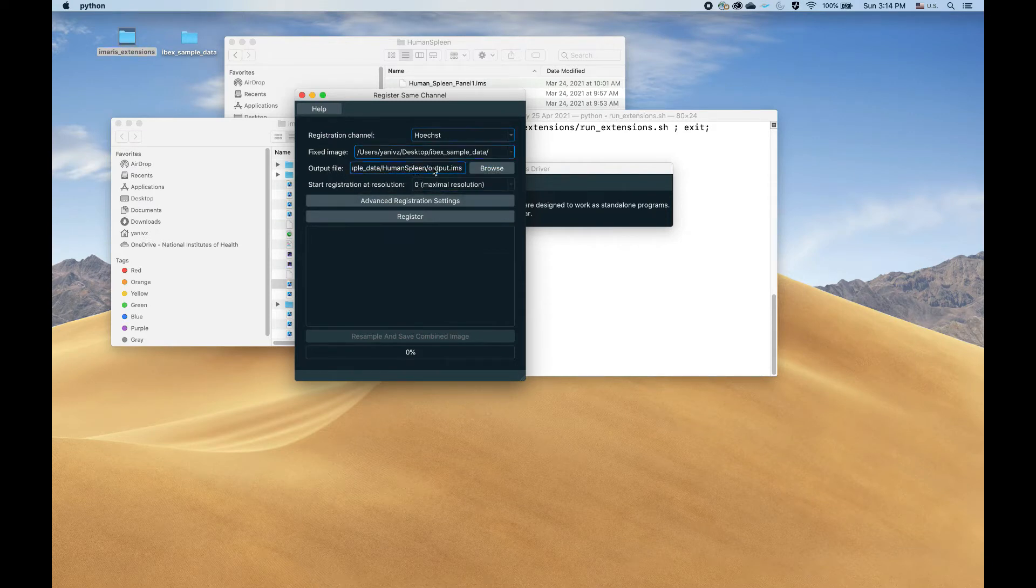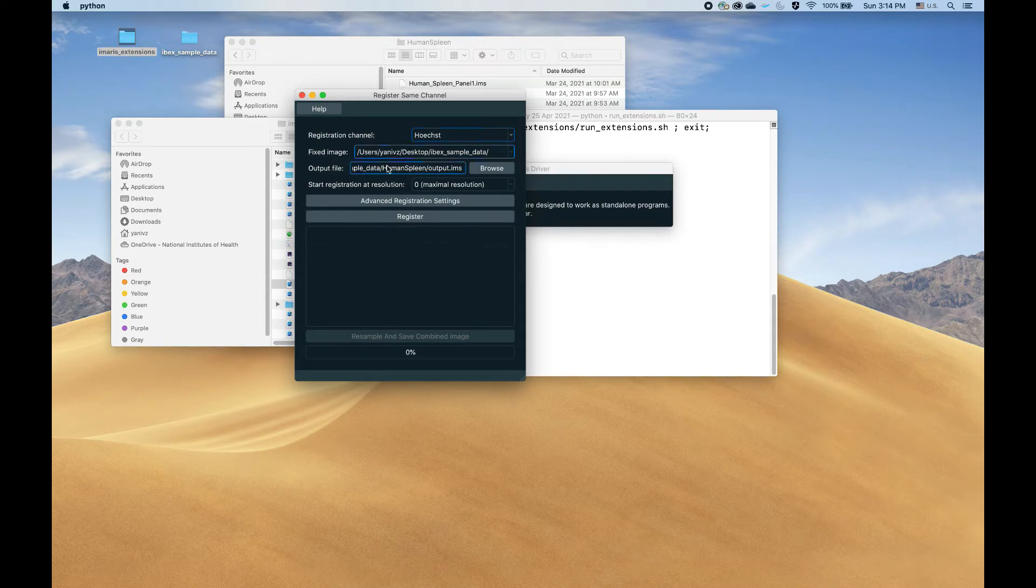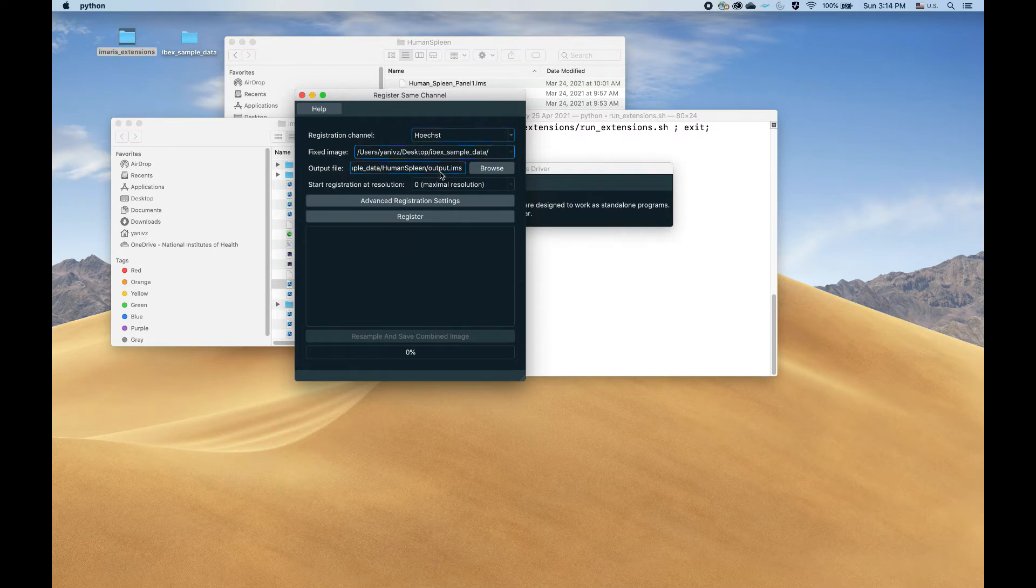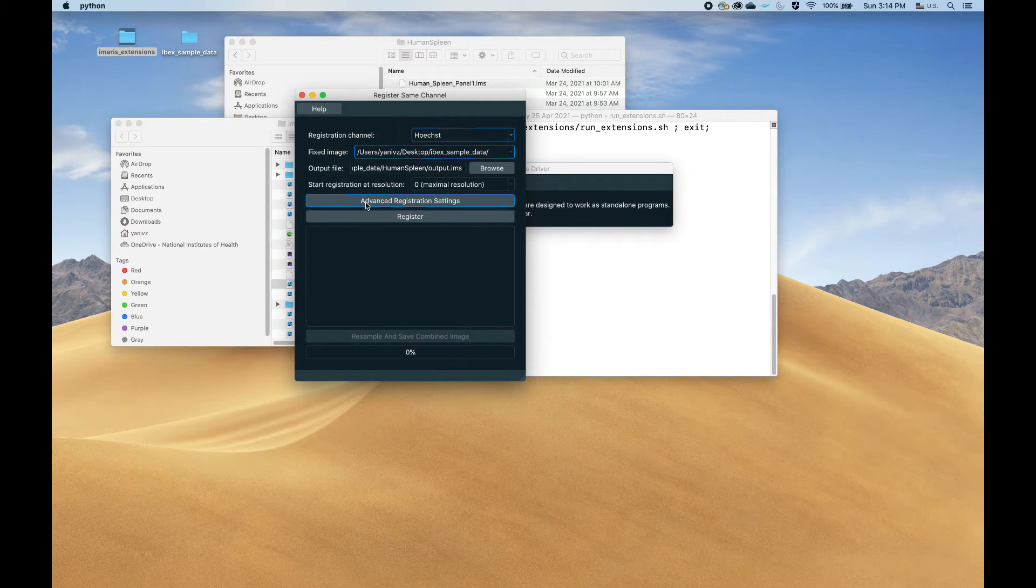The output, where do you want the output to be saved? Again, by default it's the same as the input directory with a file name of output.ims. I'm just going to leave that for now, you could change it to whatever you want.